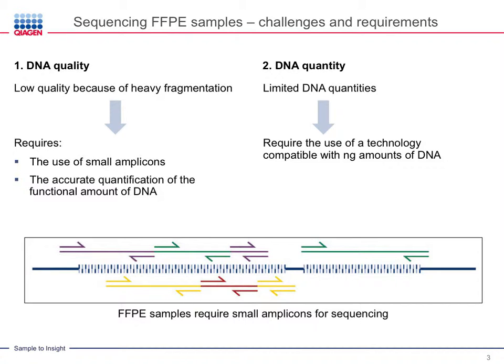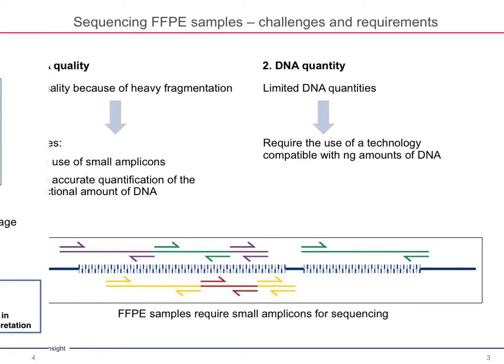The second main challenge with FFPE samples is the limited amounts of extracted DNA. Since the same FFPE block is usually used for many different tests, this translates to very little amounts of DNA, most likely in the low nanogram range, that is available for sequencing.